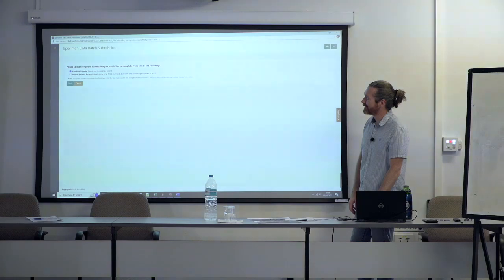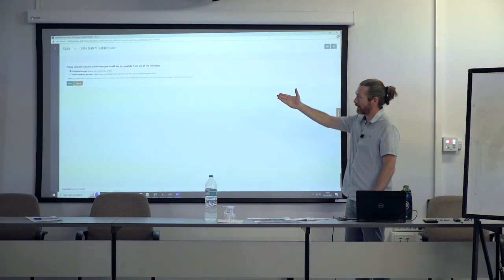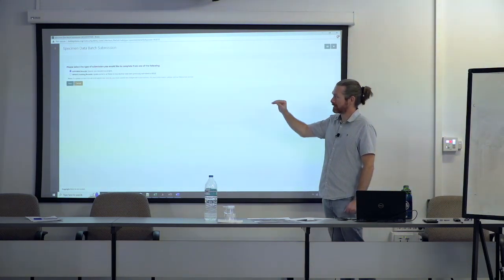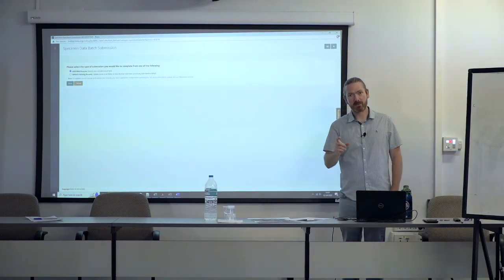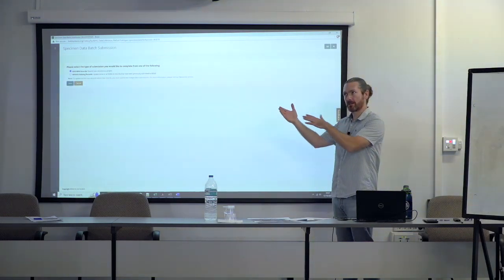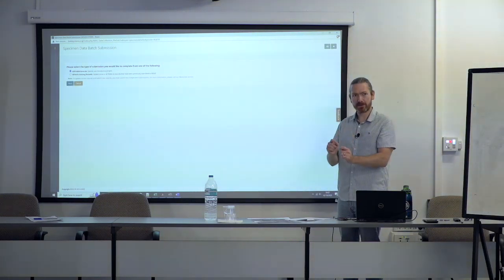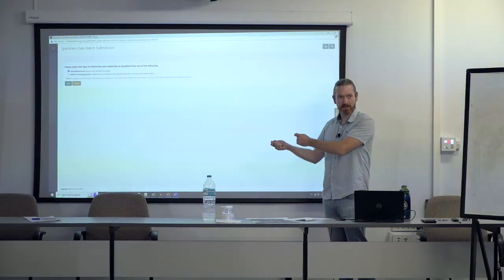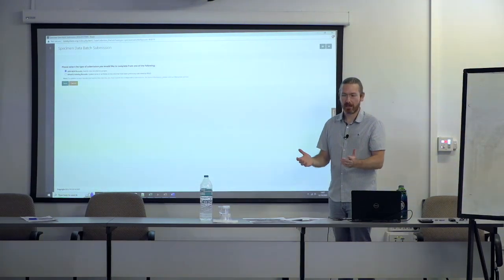Sometimes, if you're doing a batch submission, it asks you, do you want to add new records or update existing records? We're going to add new records, but if you do update existing records, you've got to be really careful, because the mechanism is you download a spreadsheet of the records to update, and say you want to update just one field, that's great. But if you make a mistake in any of the other fields on any of those records, you re-upload that spreadsheet and it will overwrite what was previously there with what you've changed. So you need to just be really careful with that.